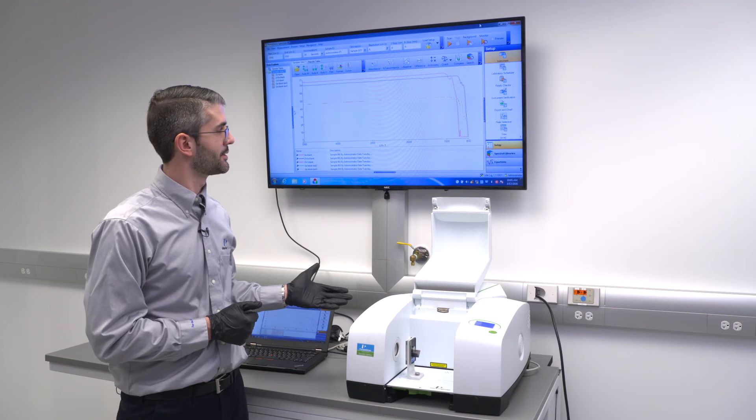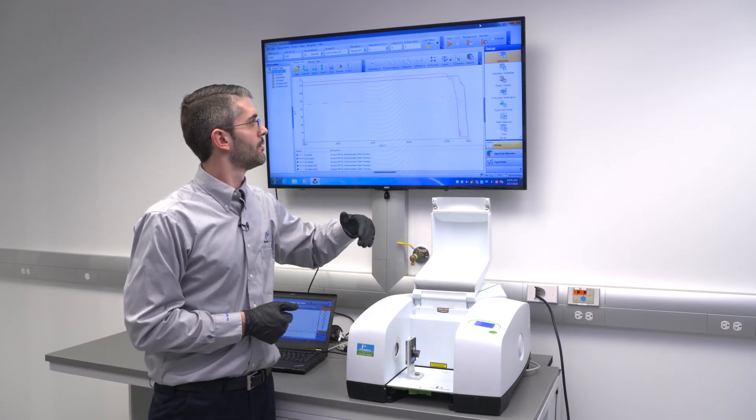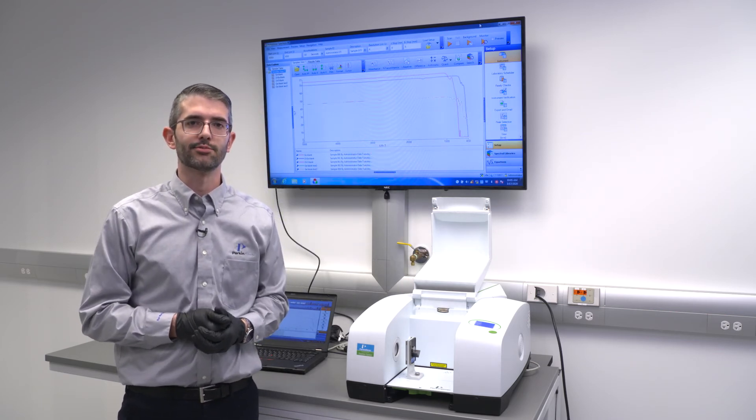Ordinarily, when testing samples of this type on an FTIR which is not equipped with these sorts of design benefits, we may see transmittance values which actually taper up or which do not actually drop towards zero percent at this point.